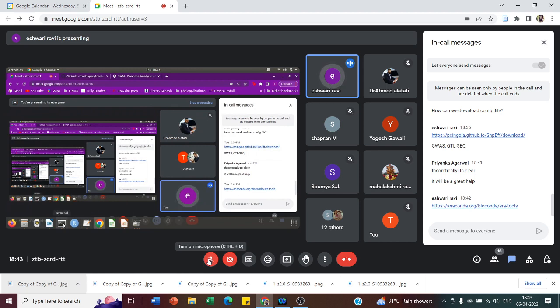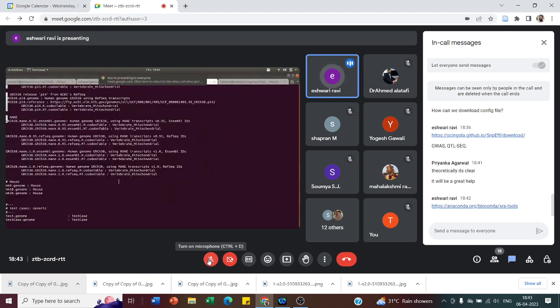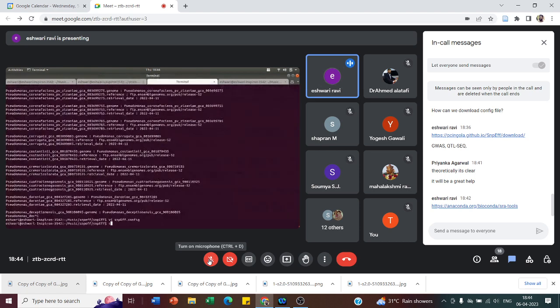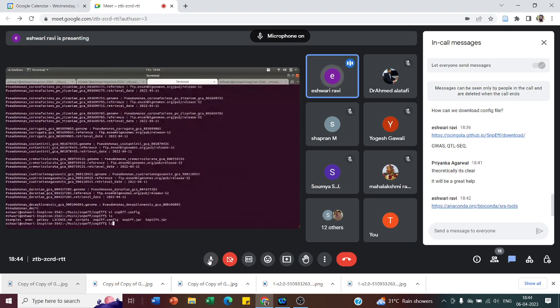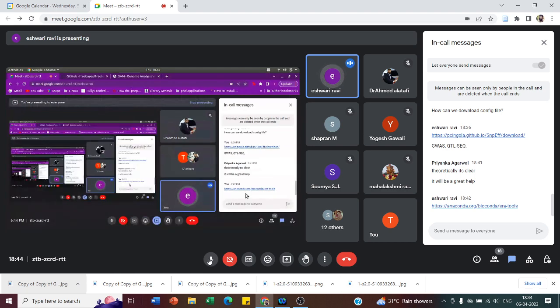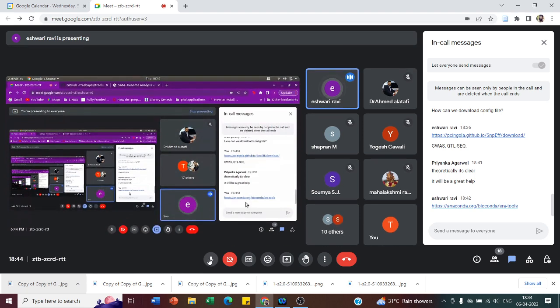And don't forget, whenever you install a tool, there are always a list of options. You can always take a look around and check with each and every option it has. You can always go for functions like certain tools annotate, certain tools also do all trimming and mapping at the same time. So you can also do that as well.